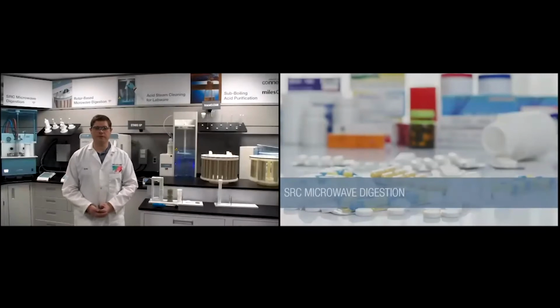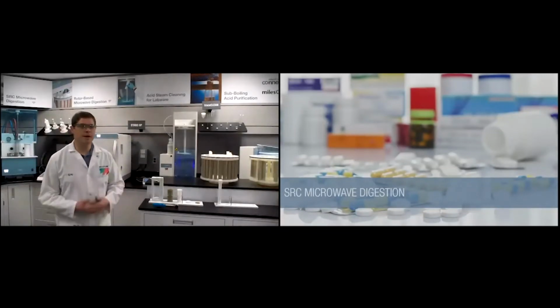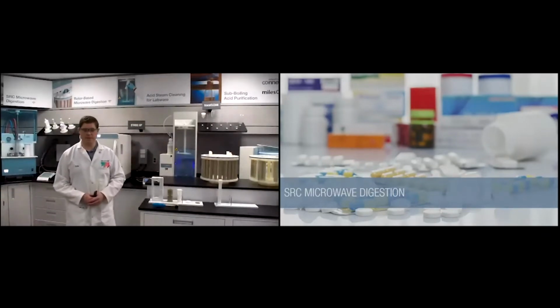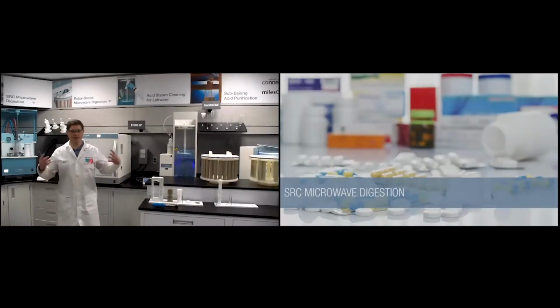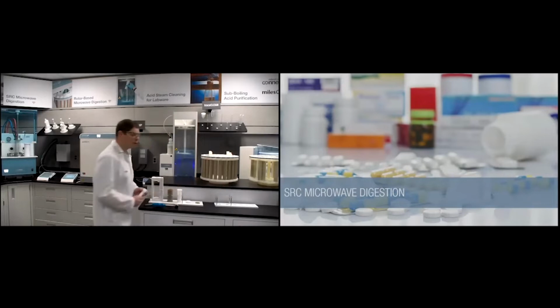The rotor-based microwaves have been around for well over 30 years, and they're the workhorse of the lab. They do have some limitations inherent to the technology. The need to batch similar type samples together of similar reactivities. You can only go so hot for so long because you're limited by the melting point of the polymer material which comprises the rotors. Also, there is that vessel assembly and disassembly required.